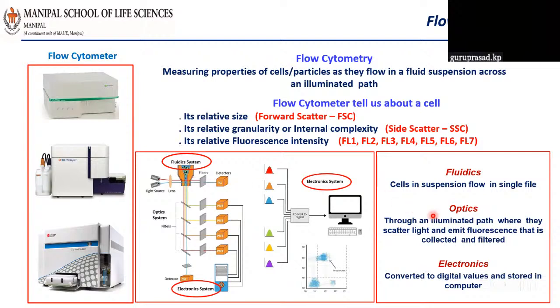And the second thing, there is the optical part present in the instrument. Generally, the optical part includes lasers. I'll talk about that later. What the optical part does is shine light on the cells, in other words, illuminate them. Lasers are used as the source of light. When the laser light is on in the machine, the light is passed through the cuvette where the cells are moving in a line, so that each and every cell is exposed to the light.